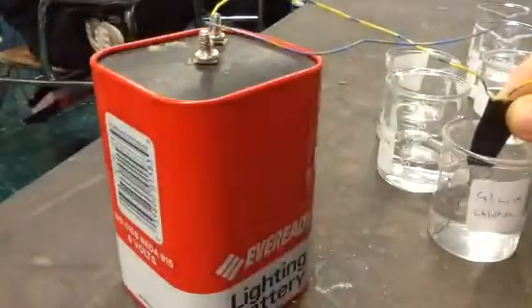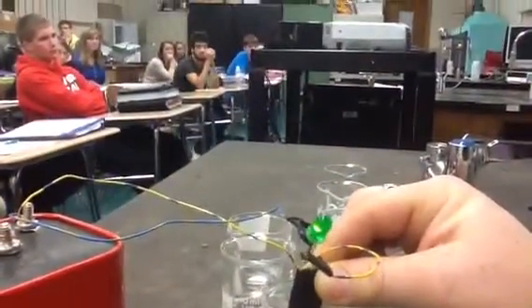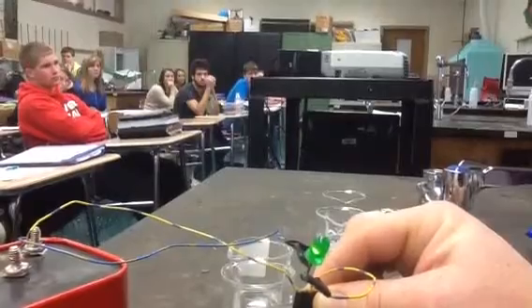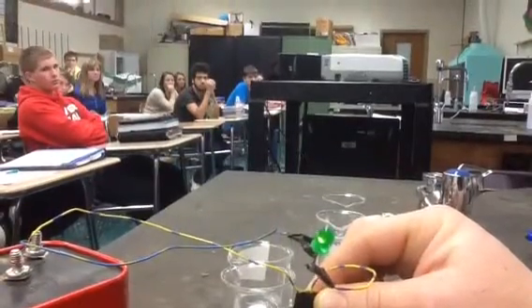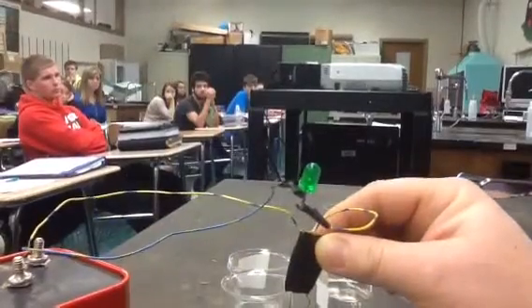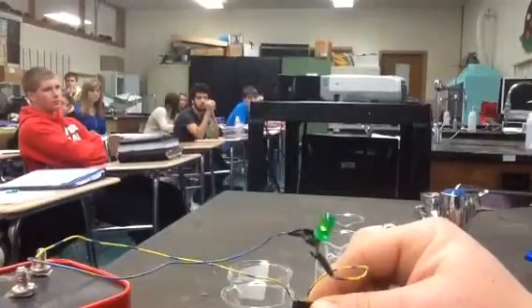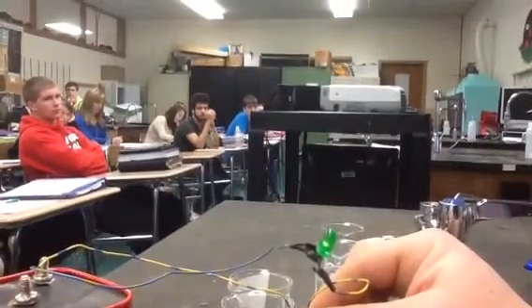Whoops. And we can't see that on film, but can you guys see it? Brianna can be my guarantor here. Calcium chloride solution. That puppy is lit. So you can see that the calcium chloride solution does in fact conduct electricity.